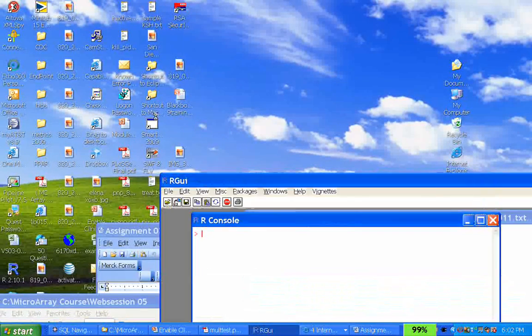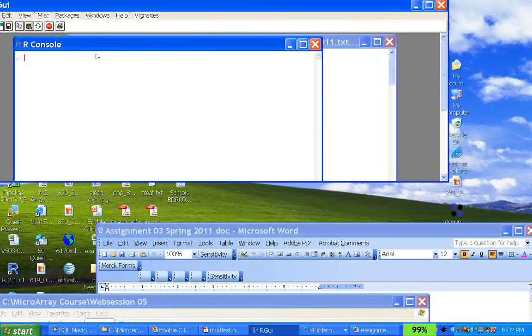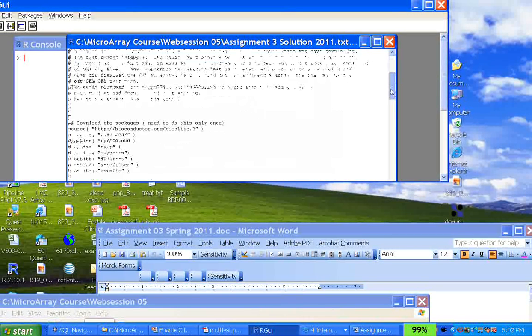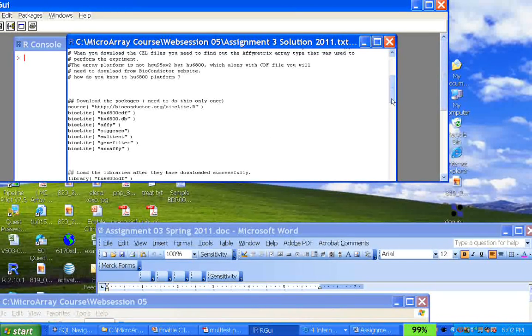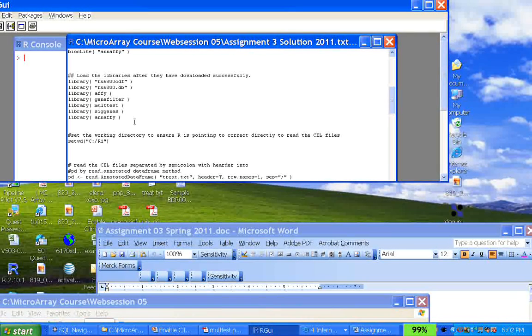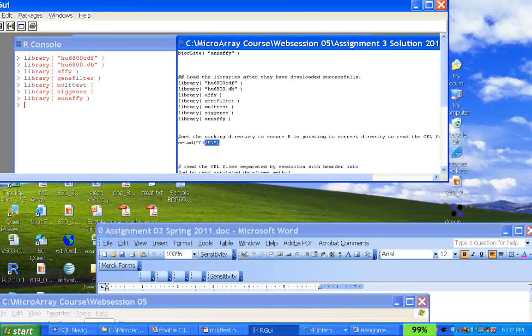I just want to make sure that R works before I get more into this lecture. Just give me 1 second. It does take a lot of time, but okay, should work.